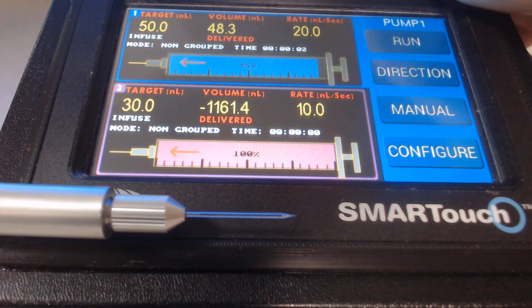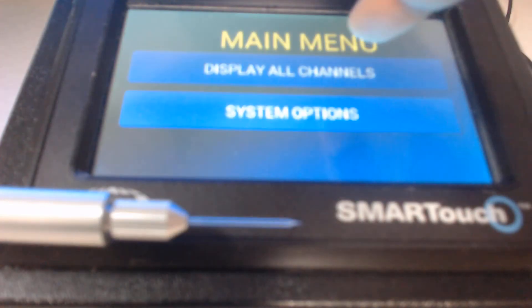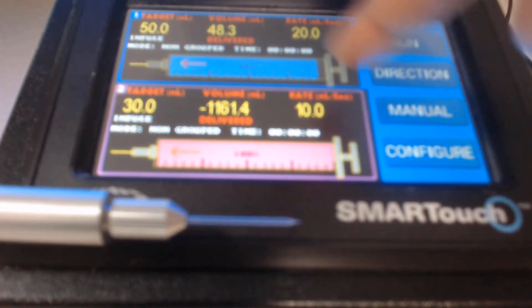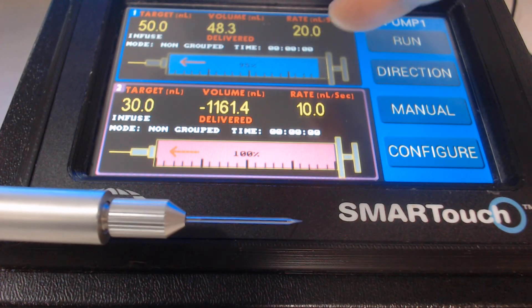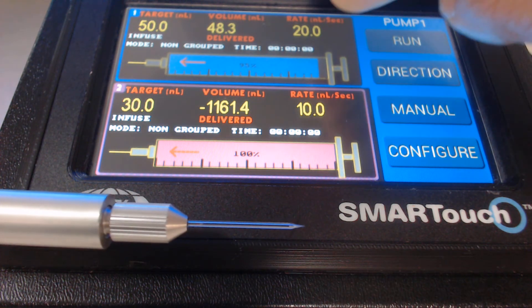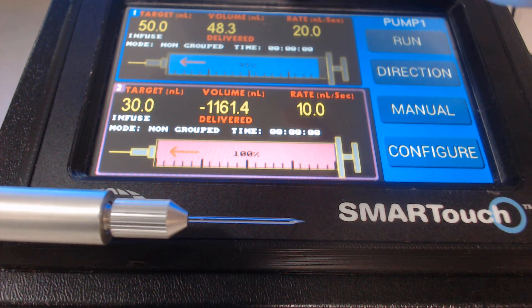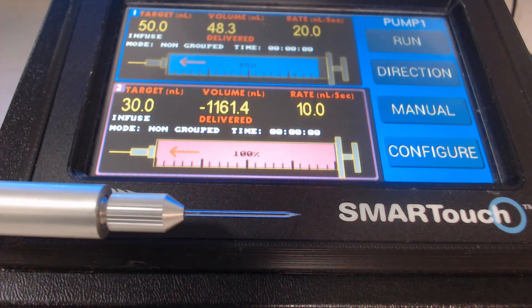Next time you want to inject, simply turn on the screen, touch the controller, go to display all settings, and all your last settings are saved under channel 1 (pump 1) or channel 2 (pump 2). Plug the nanoliter injector back into the port and you are able to use the last settings directly.